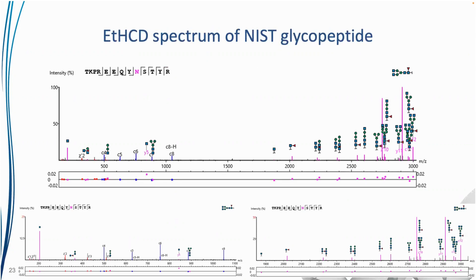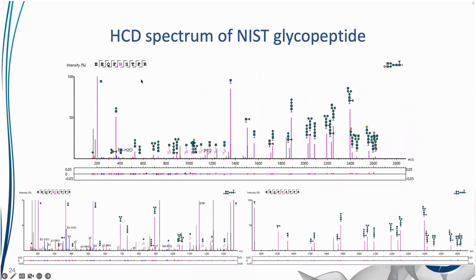Here's what a typical glycopeptide spectrum looks like within GlycanFinder. In the lower m/z range for the ETHCD data, we see a series of C and Z ions supporting the peptide sequence, and in the higher m/z range, glycan fragmentation ions are visible with glycan structures annotated above each peak. For the HCD data, we have a nice B and Y ion series supporting the peptide sequence, and with more abundant glycans, it also does a fairly good job at fragmenting the glycan.